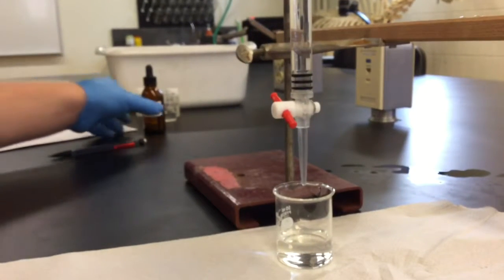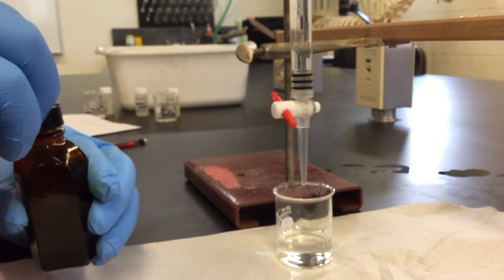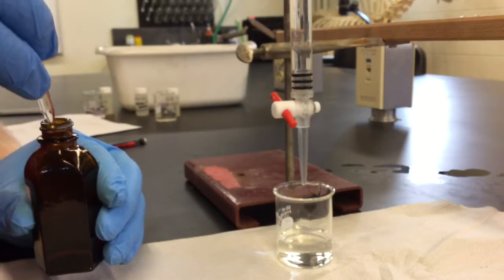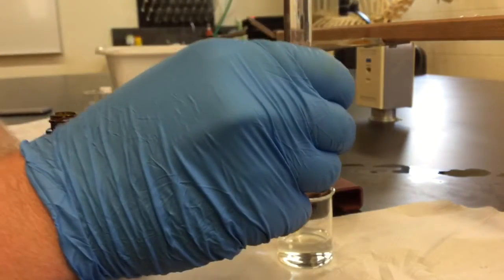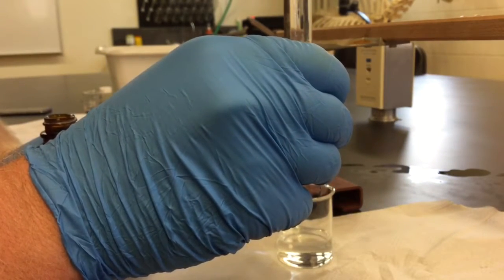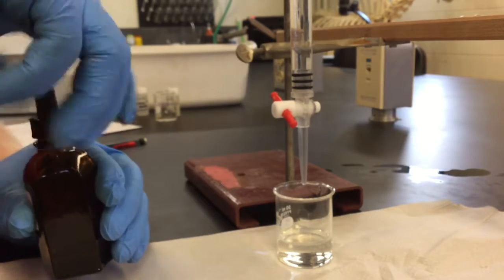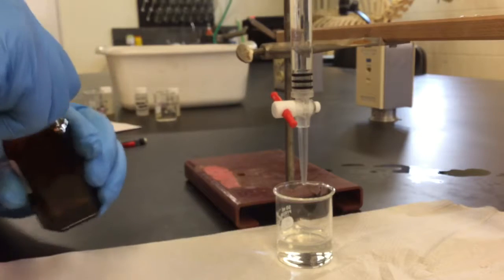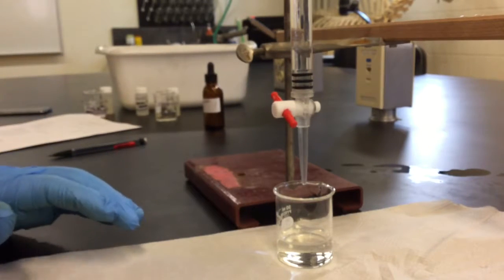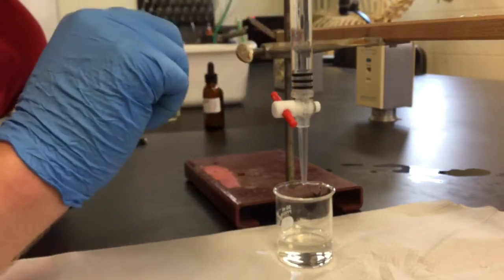I will add three drops of the phenolphthalein indicator. This is a base indicator, meaning that once the solution in the beaker becomes basic — so a pH above seven — it will turn a faint pink color, indicating that we have neutralized all of the acidic ions within the beaker.